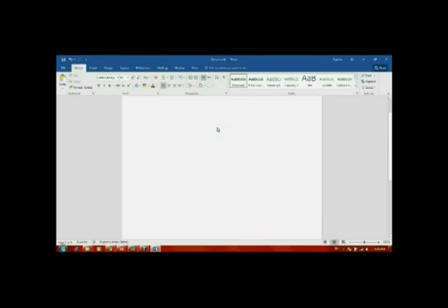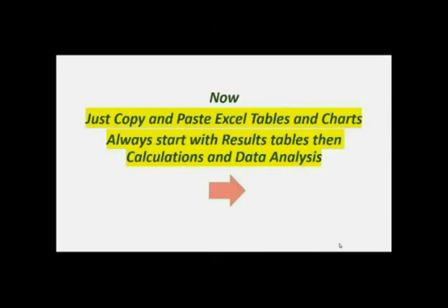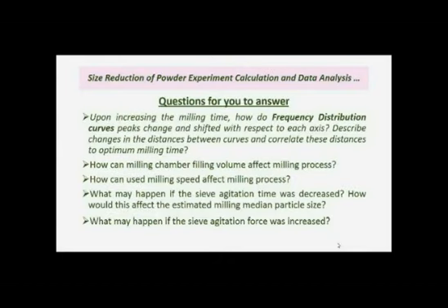Now, just copy and paste Excel tables and charts. Always start with results tables, then calculations and data analysis. Here are some questions for you to answer. Most of these questions, if not all of them, have been covered during discussions and the experimental part.